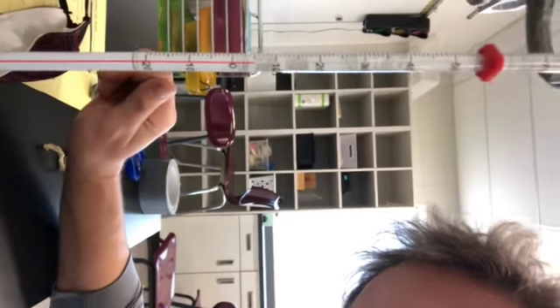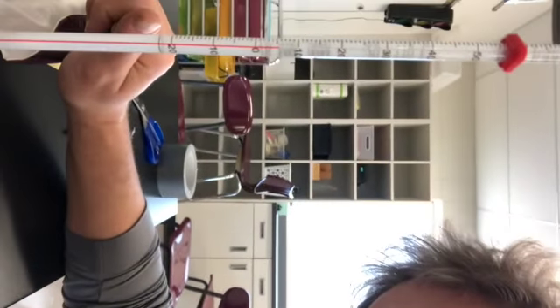All right, now we're at 5 minutes. Let's see what's happening. You can see that the snow is now turning to water. But let's see what our temperature is. You'd think that heat would make it higher, but it's really not any higher, is it? It's still about, let's say, 5 degrees. So we only went up 3 degrees in that first 5 minutes. Okay, let's try the next 5.